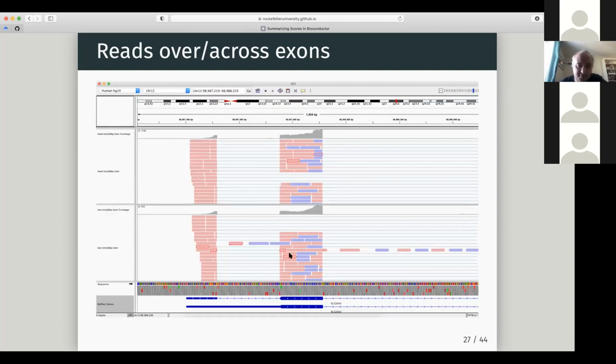If we can see, part of the problem here is this: we have all these reads here spanning these exons, and we just want to count this once, right? We can't count this part in this exon and then summarize it up. Otherwise we'd get 2 times. And then we've got to decide these things which span into exons. So this read here, or this read here, there is no gene model which accommodates an intronic read, a read mapping into this intron. Do we count it? Do we not? Summarize overlaps will take care of this for us.